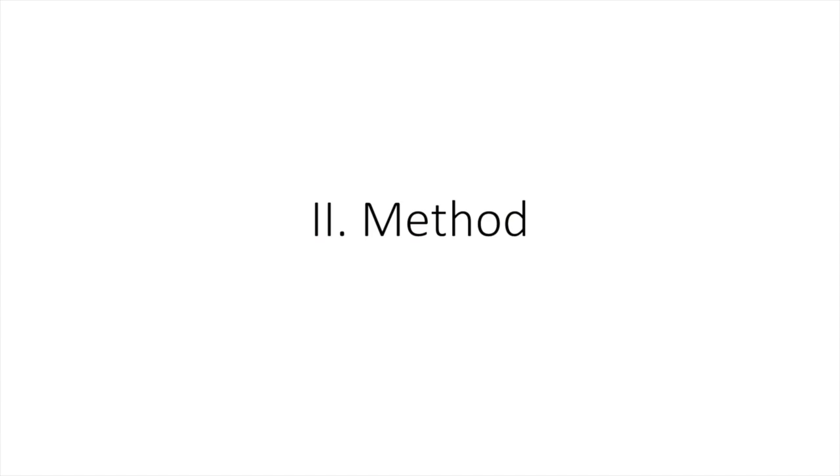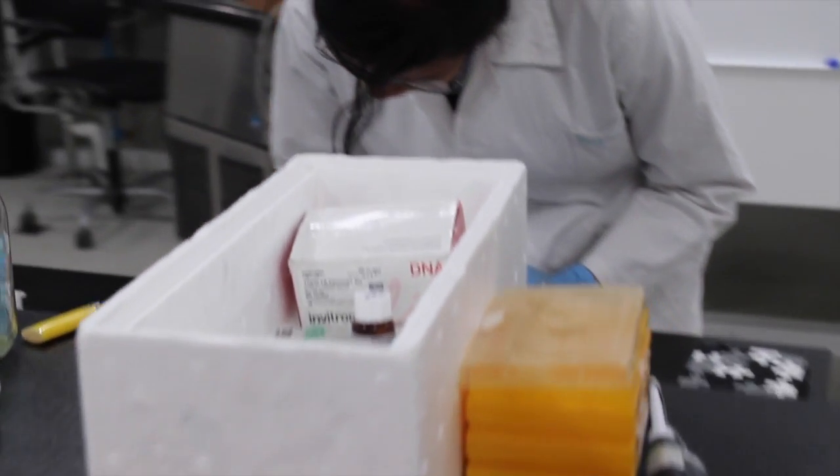The following protocol for ligation of a PCR product in the pCR 2.1 TOPO vector by complementarity in the TA extremes, thymine-adenine, is based on the manufacturer's recommendations. Plasmid and PCR product are thawed on ice.